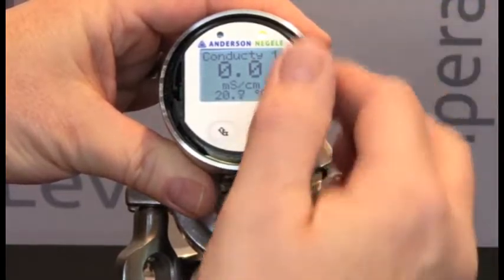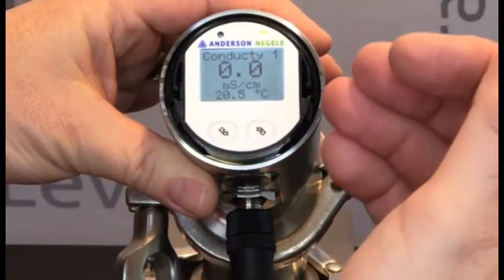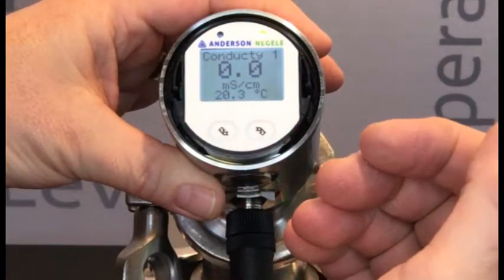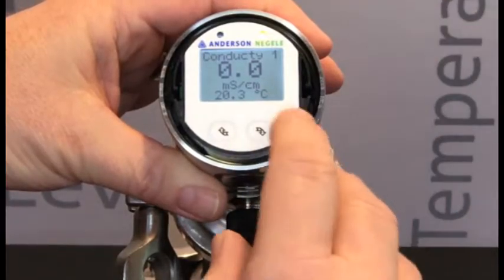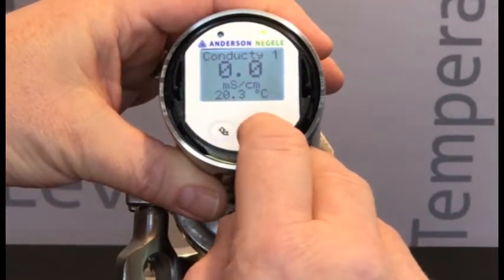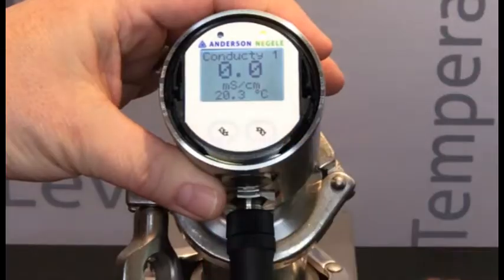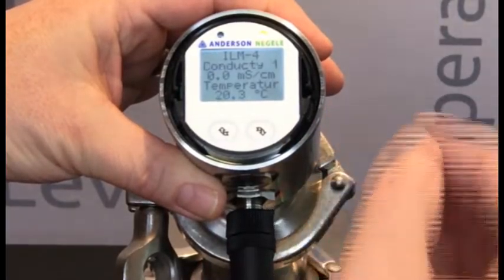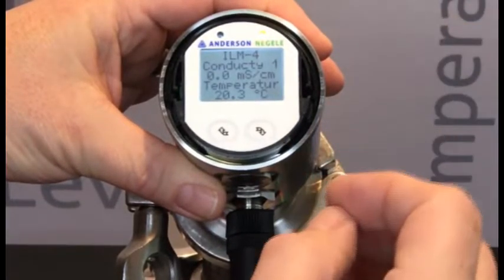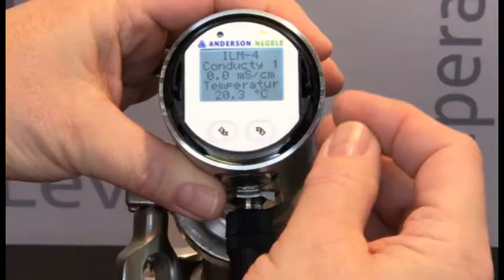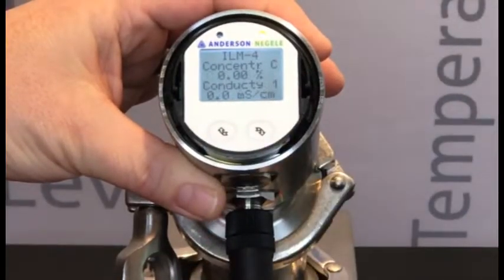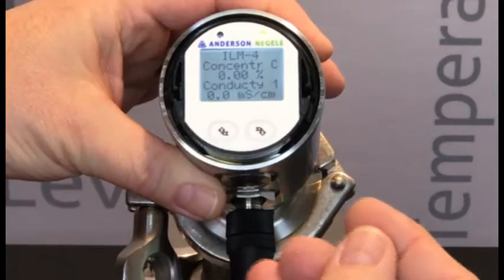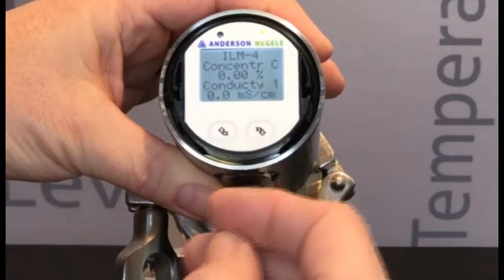We can now access multiple process variables that are internally calculated within the device but may not be assigned to analog outputs. To do that, we're going to give short presses of the right-hand button. My first press will give me that primary conductivity measurement — conductivity 1.